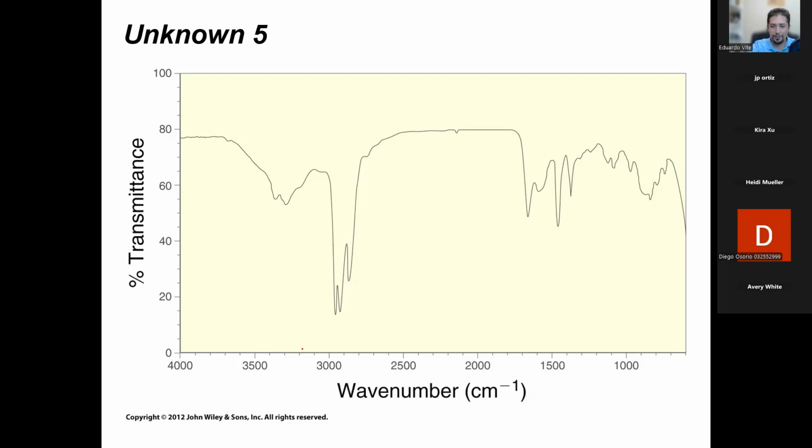Why? Because amines are usually found between 3200 and 3500. They are not very strong, and you can see whether there's one or two peaks in that region. Since you see two of those, this must be the nitrogen hydrogens stretching right there. At 3000, this is just your carbon hydrogen. What are these? I don't know, man. This could be anything else. Probably one of these is like a carbon nitrogen bend of some sort. I don't know for sure. We can't make claims. All I know is that I see my characteristic amine NH stretches, and then this is primary amine. So primary amine.